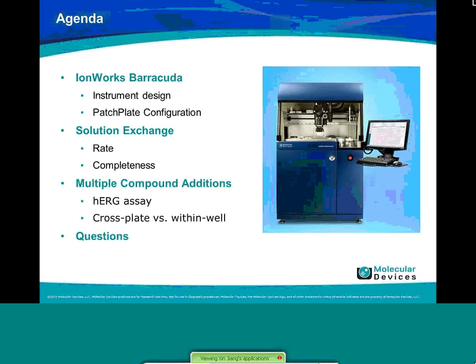So a brief agenda here. To level the ground for some of the people who may not be as familiar with the IonWorks Barracuda system, I'll spend the first couple of minutes to give a brief introduction to the instrument design and also to highlight the unique design of the patch plate, or the consumable configuration, which is critical to understanding the solution exchange feature on the Barracuda system. Also, I'll show you two different sets of studies where we characterize the solution exchange rate and the completeness of the solution exchange, with the idea to understand the ability of the Barracuda system to deliver fast and accurate compound additions for pharmacology type of assays.